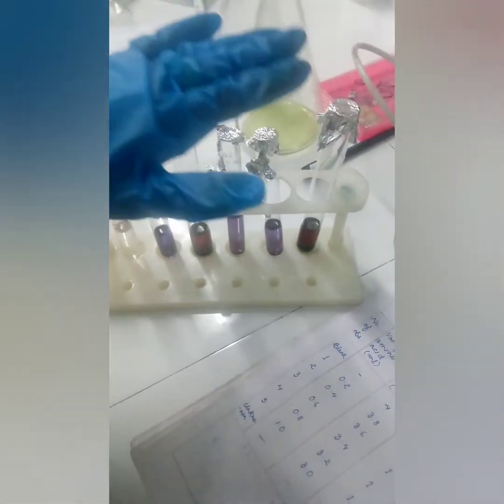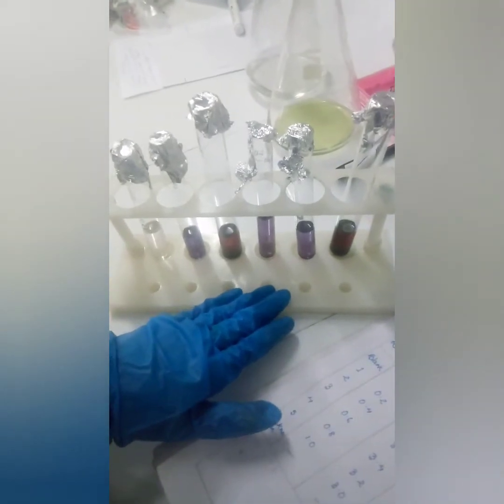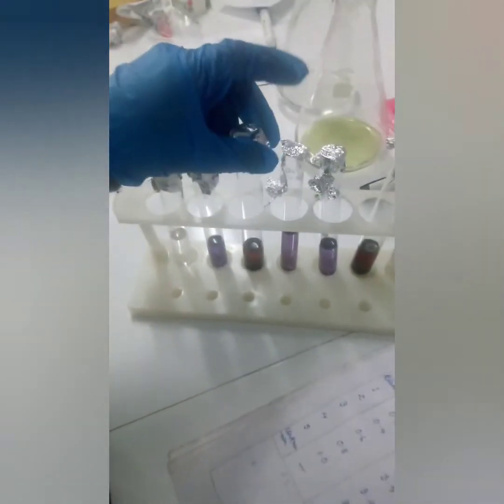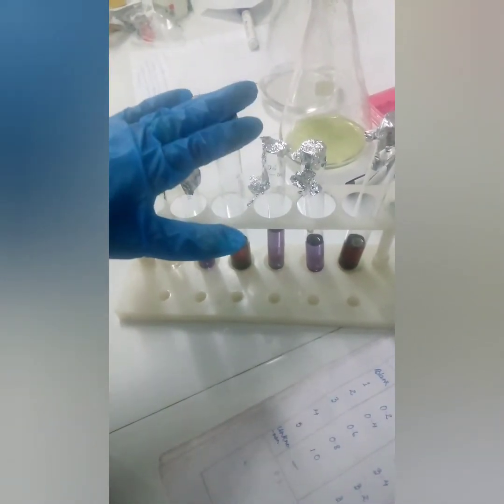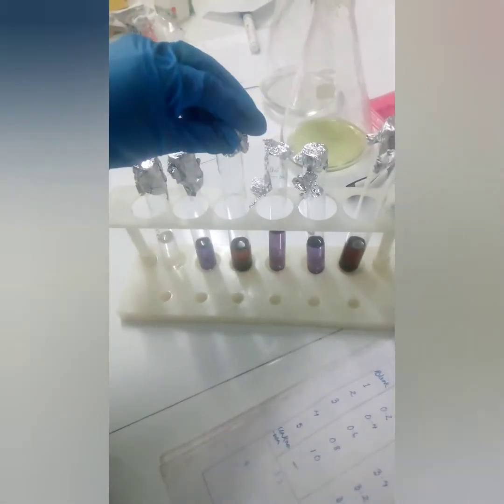Whereas in all these test tubes, because we have given different concentrations of amino acids, the color is slightly different for each test tube. Always, when you keep this inside the water bath for 15 minutes, we also have to remember that we have to cover this test tube with the aluminum foil. Then only we will keep it in the water bath and let the reaction occur.